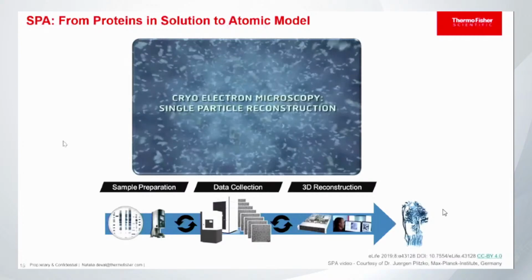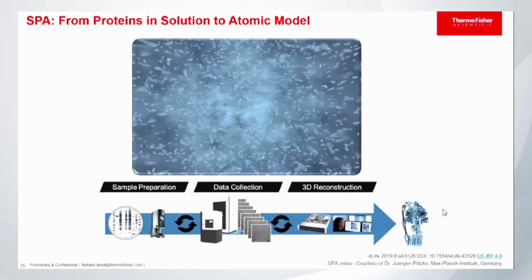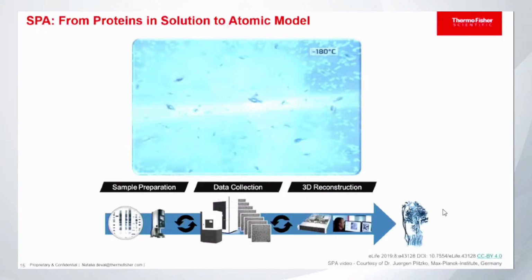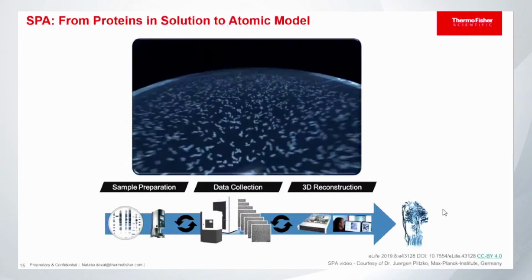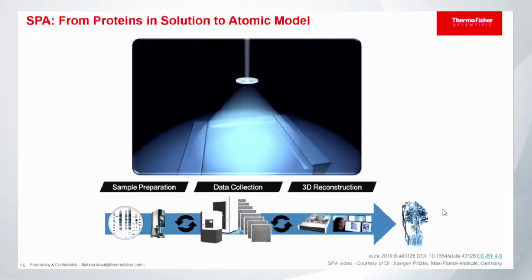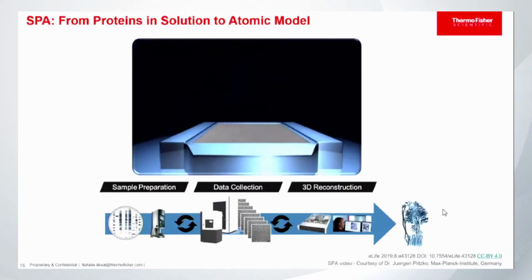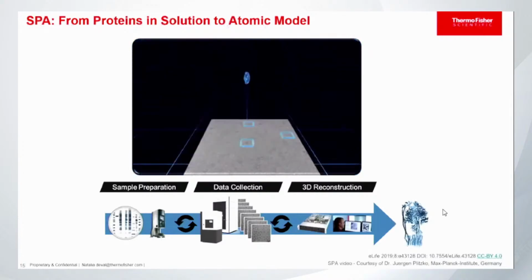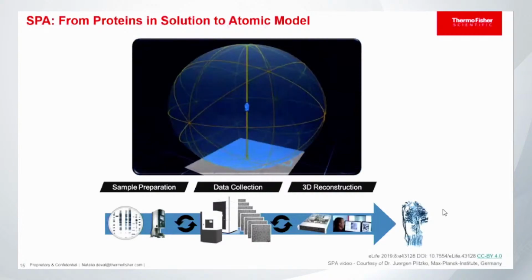So all those little guys moving around, those little whites are proteins, okay? Macromolecular complexes. And those proteins, when they are expressed and purified, they are vitrified at minus 180 degrees Celsius in a small cryo-EM grid, like it's a copper grid, 3 millimeters in diameter. So it's very, very small. That cryo-EM grid is going into the transmission electron microscope, and this is a typical image that you will be able to get under cryo conditions. So all those little shadows are proteins, okay?